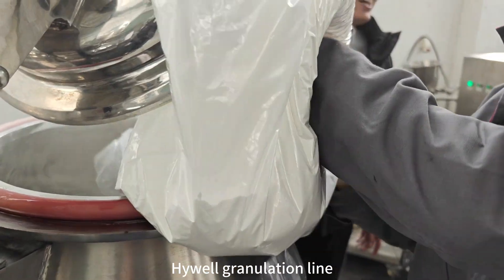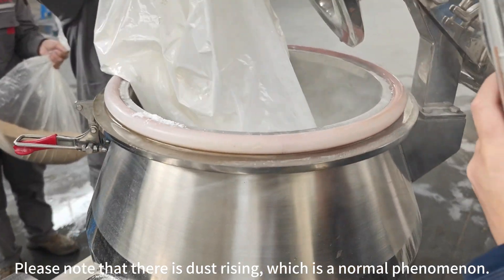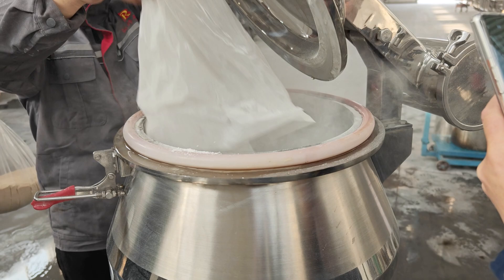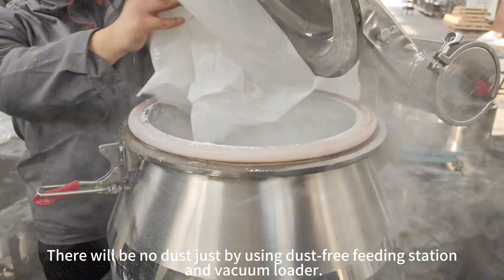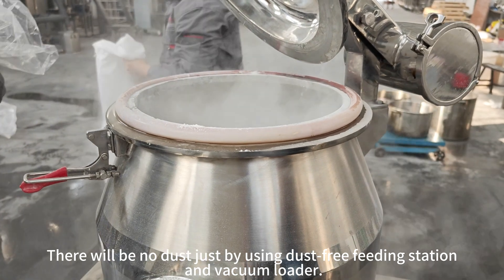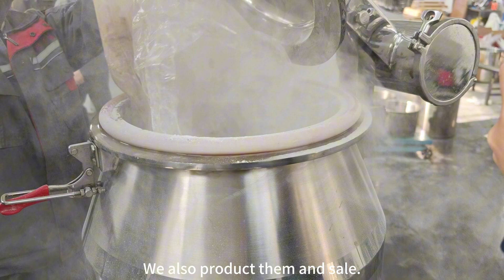High-well granulation line. Please note that there is dust dripping, which is a normal phenomenon. There will be no dust just by using a dust-free feeding station and vacuum loader. We also produce and sell them.